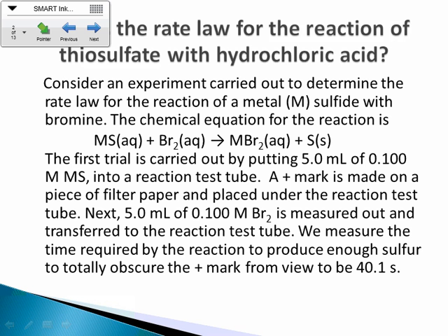So we've got this experiment, and in this experiment, sulfur is produced. Now do you guys remember what color solid sulfur is? It's yellow, right? So sulfur is yellow and it smells really bad. I'll have to show you sulfur on Monday. Yeah, it's the rotten egg smell. Have you ever been to Yellowstone? There's a lot of sulfur in Yellowstone. That's why it kind of smells bad.